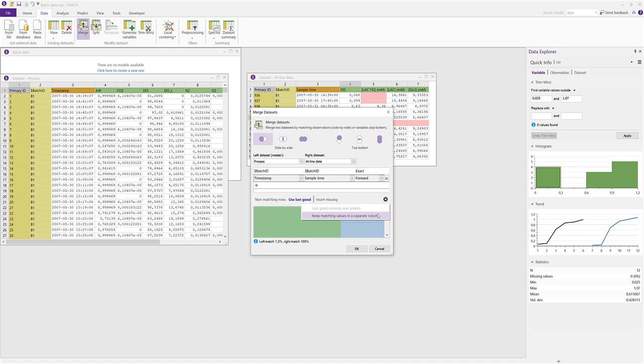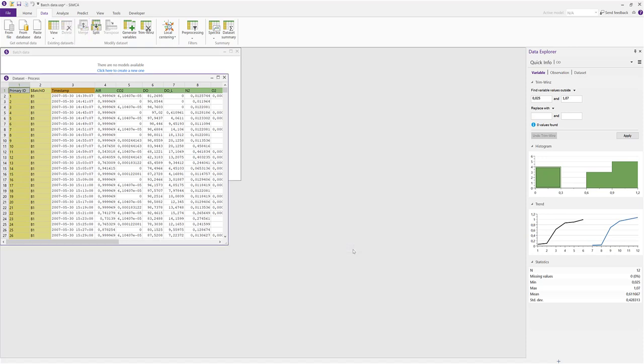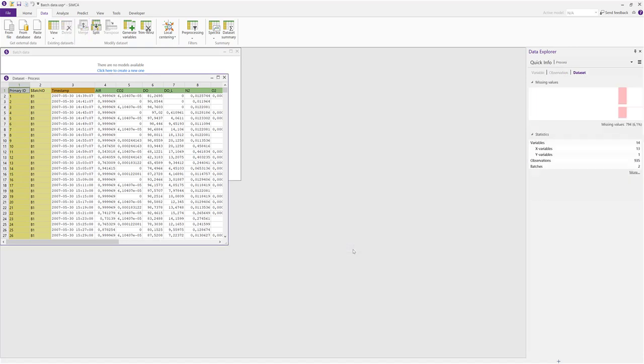And if you have a data set with many phases, this is also where you can decide if you want to let the last good value cross over into the next phase. The at-line data set is removed and the at-line columns have been added at the end of the process data.